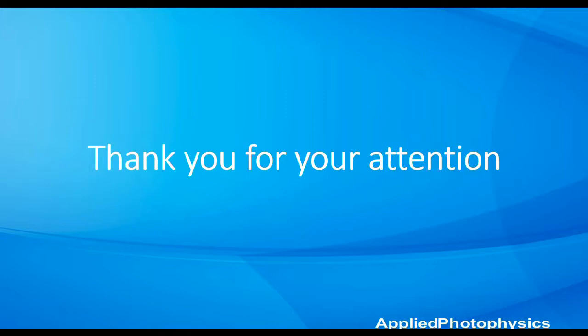I think the short answer to that is no, I'm not familiar with that specific method. I can understand the difficulty from the question of what you're trying to accomplish. We have found in our experience looking in the far UV range that there are a number of different tools that can be used to estimate the amount of different types of secondary structure, to sort of deconvolute the secondary structure.